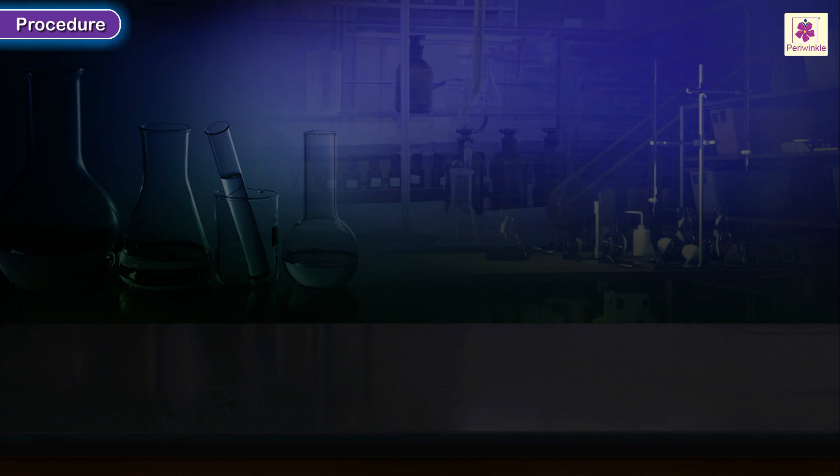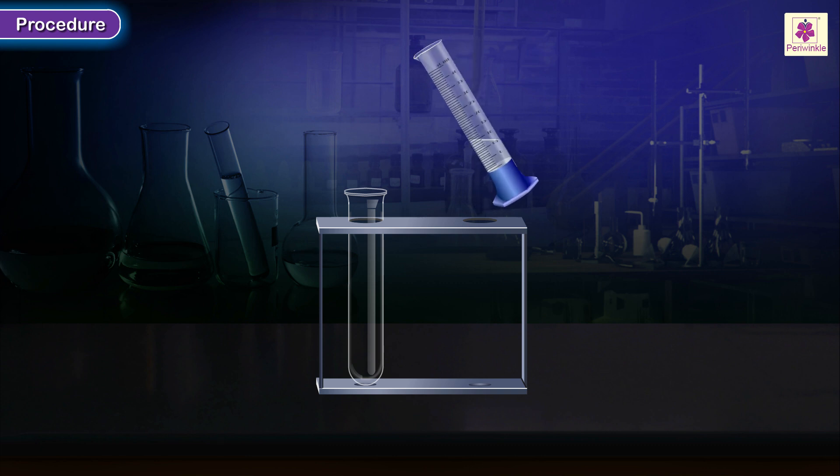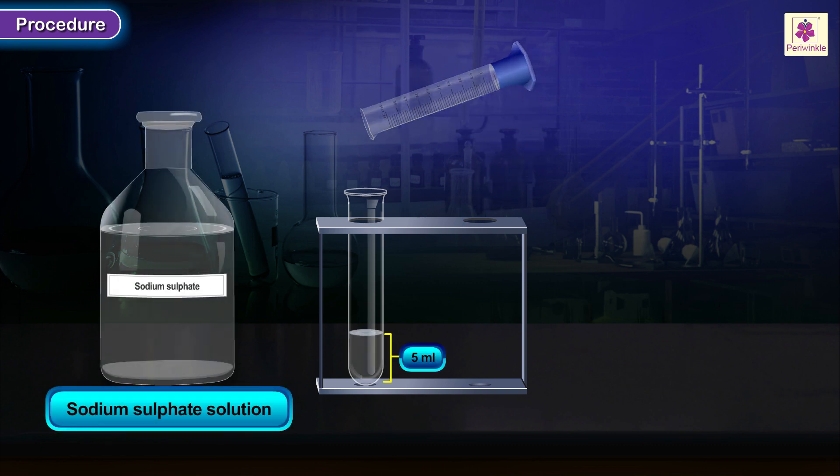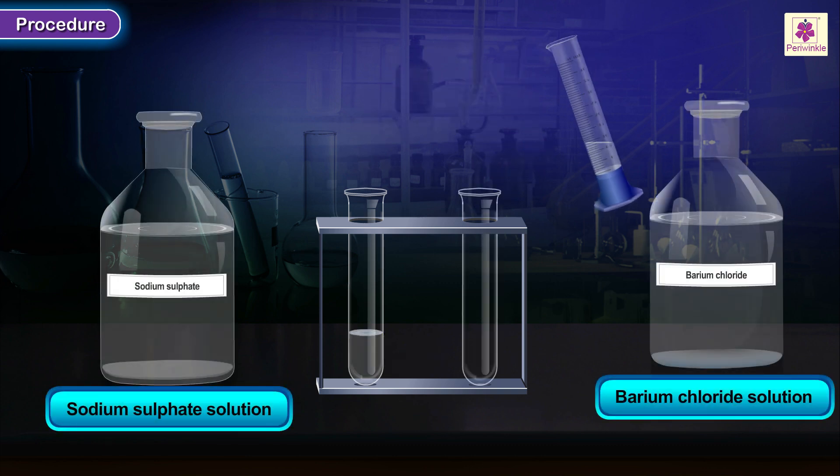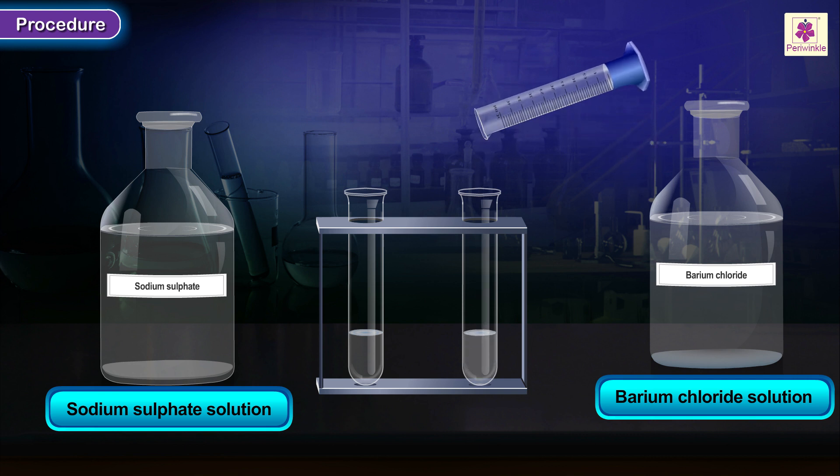Procedure: Take about 5 ml of solutions of sodium sulfate and barium chloride into separate test tubes and label them respectively.